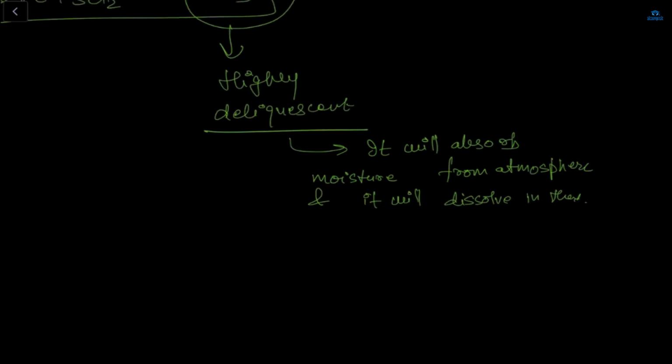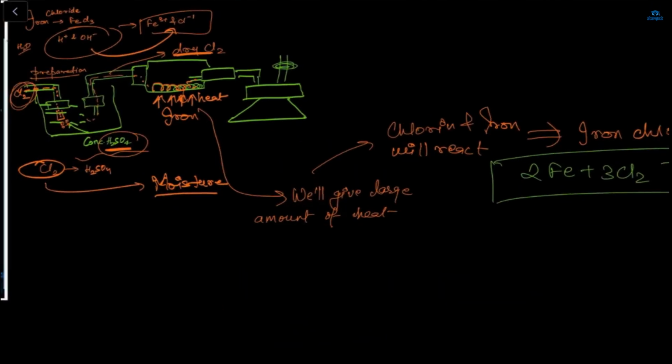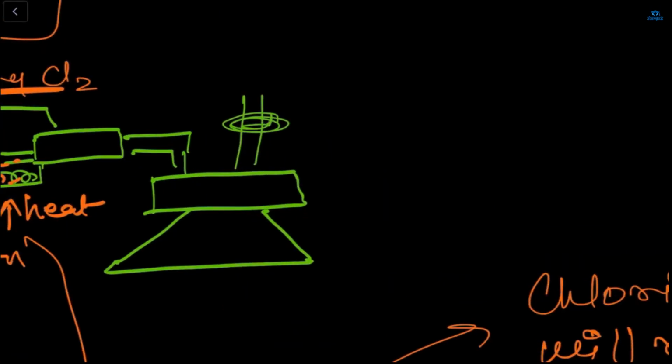Now see, here in this FeCl3, it's not fully anhydrous. Okay. Now what is the meaning of anhydrous? See, this FeCl3 is not fully anhydrous. It will absorb some amount of moisture. Then what will happen in one tube? See, this is my another tube.